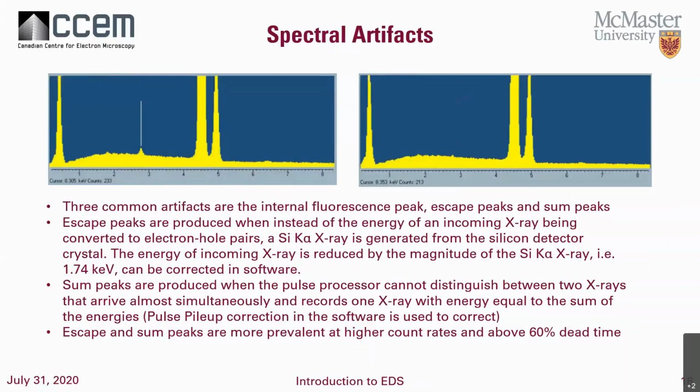When you're doing things, another thing I will point out at this time, EDS detectors do detect infrared energy. So if you do have the chamber scope on, you may get a very high dead time because of that, and you will get a very strange looking X-ray spectra.